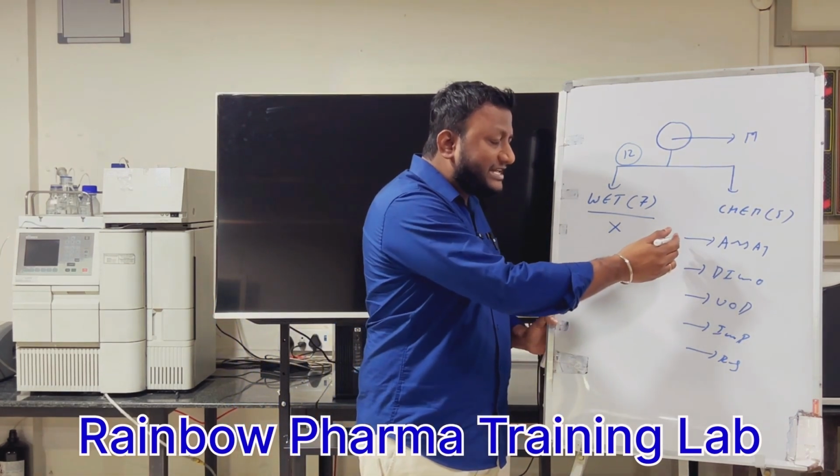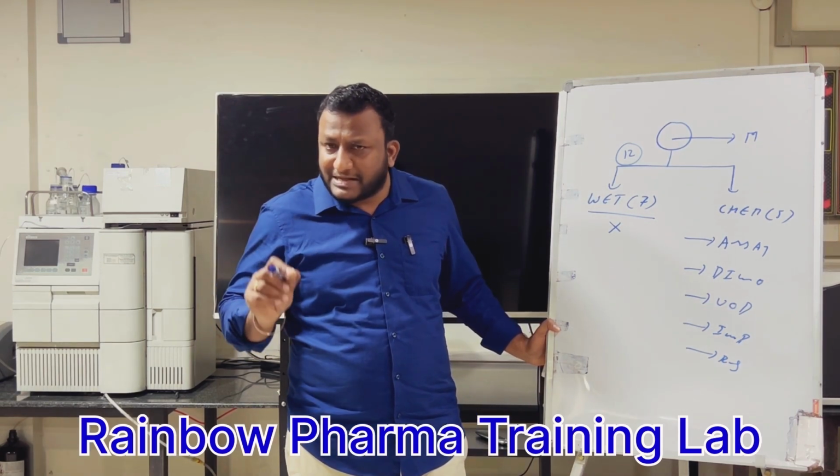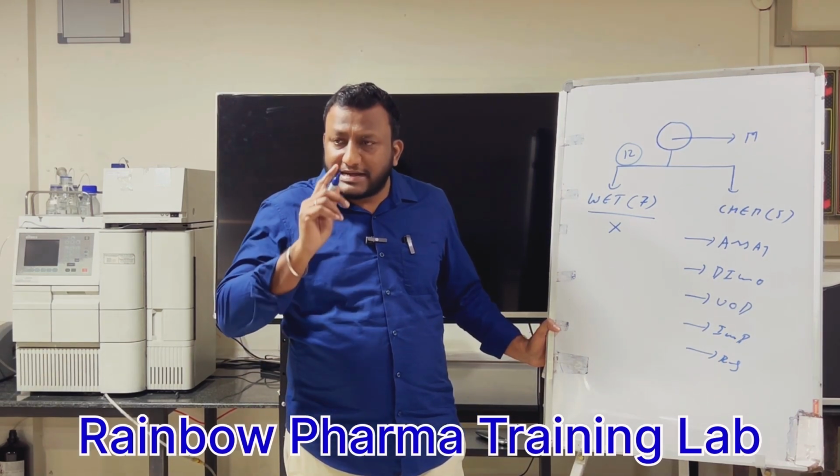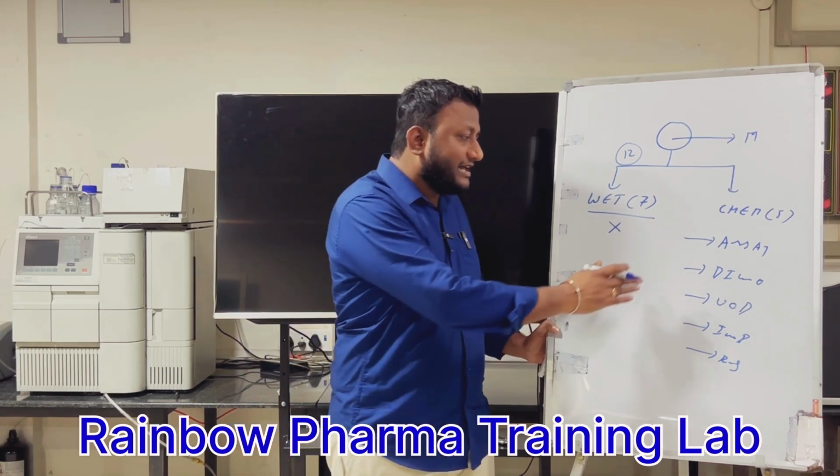So tell me, what is assay? To find out how much percentage of the drug is present in the sample. అంటే మన టాబ్లెట్ మనం వేసుకునే టాబ్లెట్ లో డ్రగ్ ఎంత ఉంది అని చెక్ చేసే టెస్టే అస్సే.